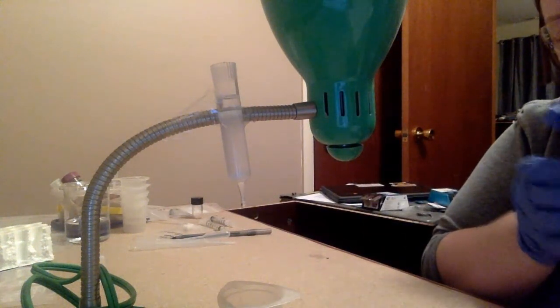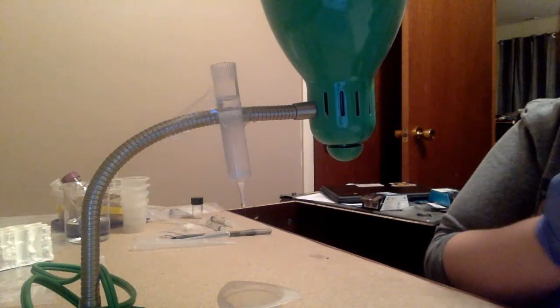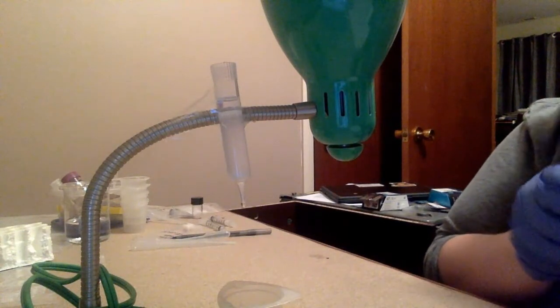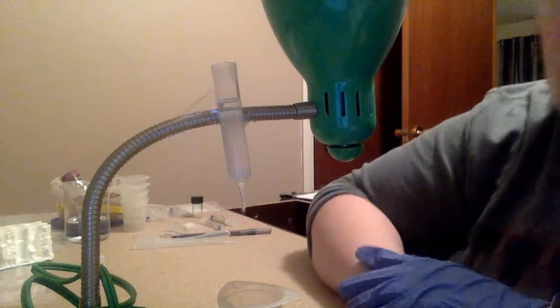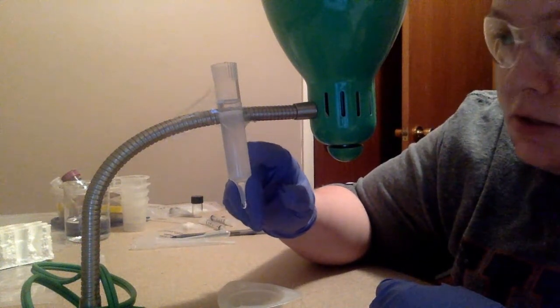So again, a little background information on gel filtration chromatography. Gel filtration chromatography separates molecules based on size. The way it works is that within this column there are small little beads. They're very hard to see.